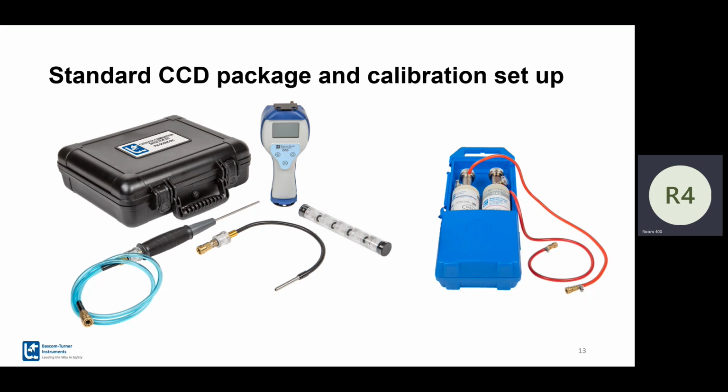Okay, so what about the one that's completely empty? It's got a little bitty filter in it. Again, they're two different filters. What are the purposes? Additional protection is really what their purposes are. The dust filter, if you are in a sandy desert environment, you might want to add that in addition to this filter.